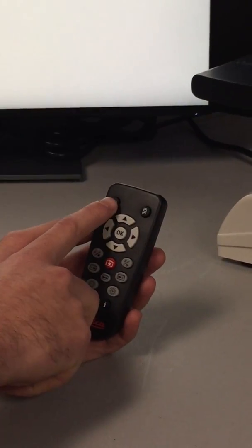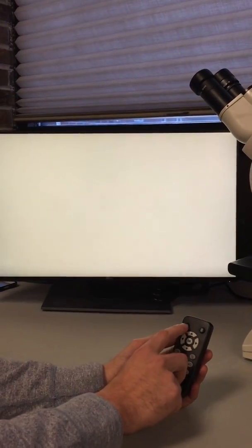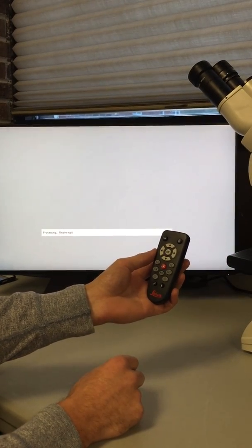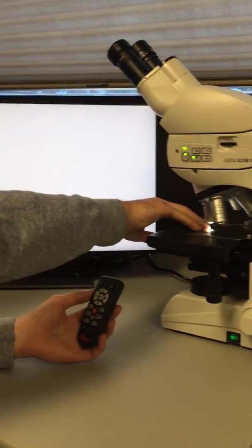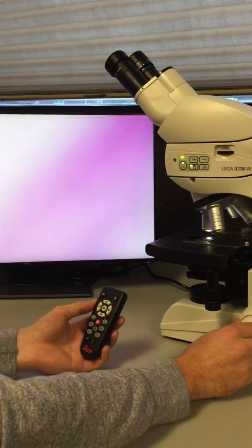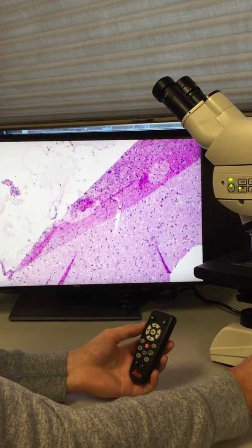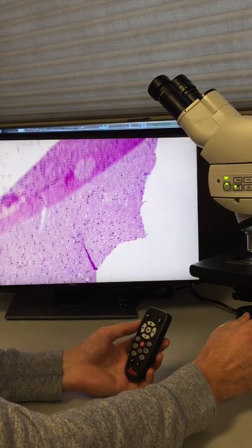This button will give you a white balance on your entire image. First, you'll remove the slide from your sample, and then click the white balance button. After it's completed, you'll put your slide back on the microscope. And you have a nice, white balance, clear image.